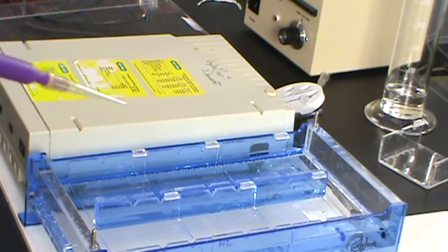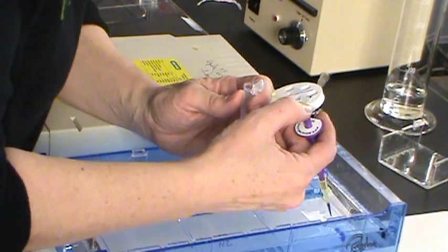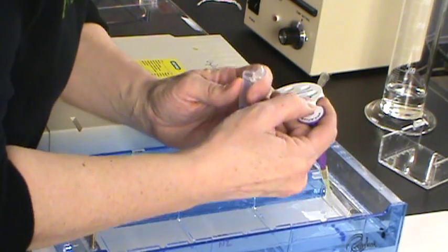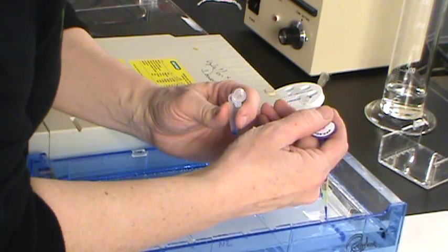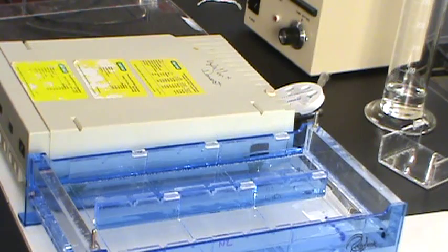And for these, we just go down all the way, suck up our sample, and we can apply to our wells. There is a little glycerol in this sample so that the sample tends to sink in our solution. Be sure, if you have any questions about applying these samples or doing any of this work here, to ask questions. That's perfectly fine and good.